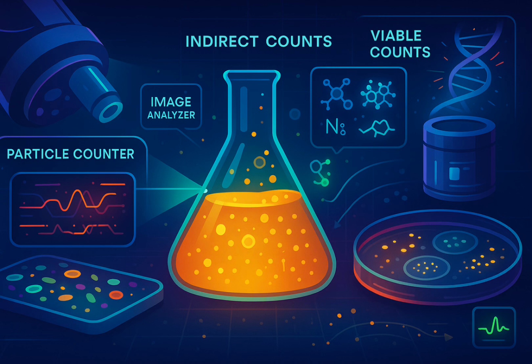Okay, shifting to the molecular level. PCR-based technologies, how do they fit in? PCR, polymerase chain reaction, is mainly about detection and identification, not usually precise counting, although quantitative versions exist. Its strength is finding specific DNA sequences. Like a genetic fingerprint. Exactly. You amplify a target sequence unique to a certain microbe or group, design primers, cycle the temperature, and the polymerase enzyme makes copies. Billions of copies from just a few starting molecules. Makes it super sensitive for detecting even rare organisms like pathogens. You typically see the result on a gel.